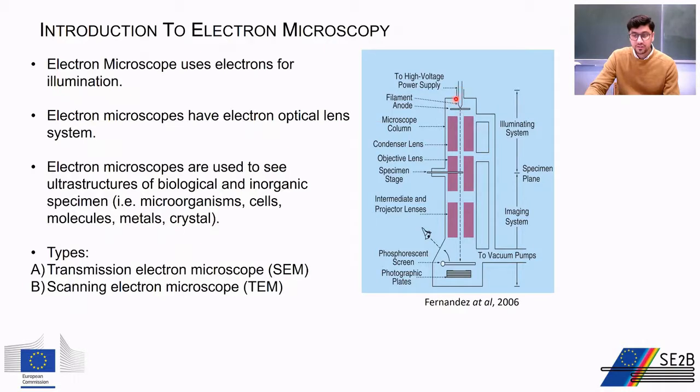As you can see here in this picture, through the electron gun, the electrons are generated, which travel through the electron column, and they strike at the stage where the specimen is present. So at this stage, the specimen can interact with the electrons. Either it can scatter the electron, or electrons can be transmitted through the specimen until they reach the stage where there is a detector, and these electrons are detected and information stored in the sample is generated.